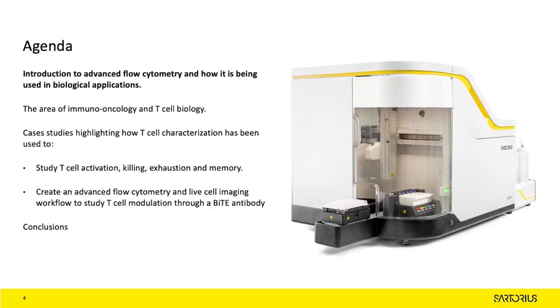Finally, I will discuss two workflows, one of which will focus solely on advanced flow cytometry, and the second will suggest a method of how flow and live cell imaging could be combined to provide deeper insight into T-cell biology and how it can be modulated by therapeutic drugs.